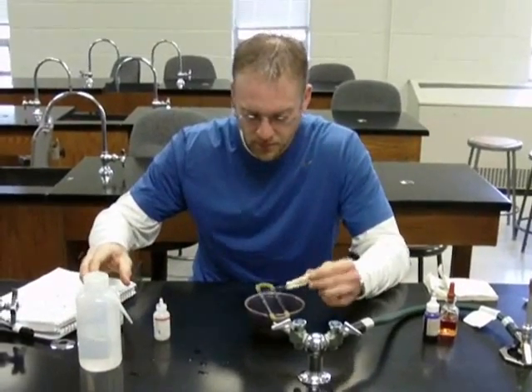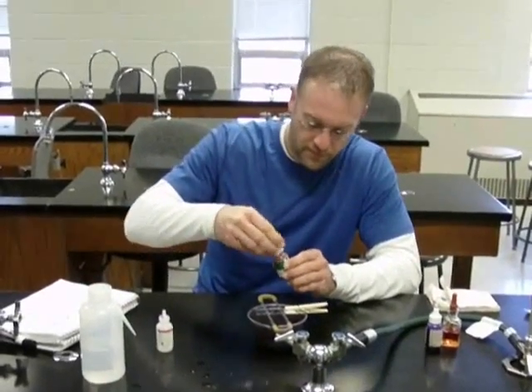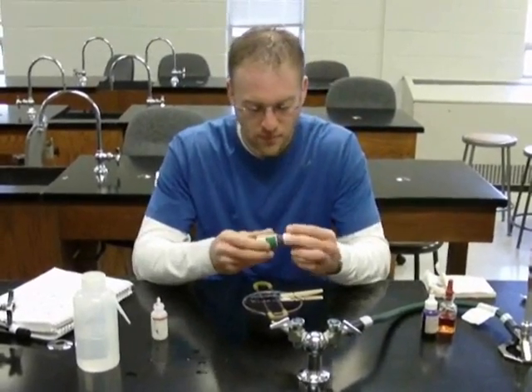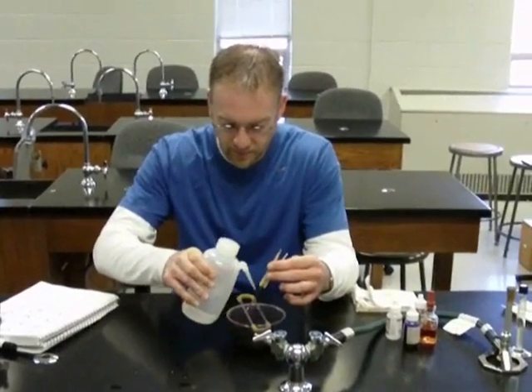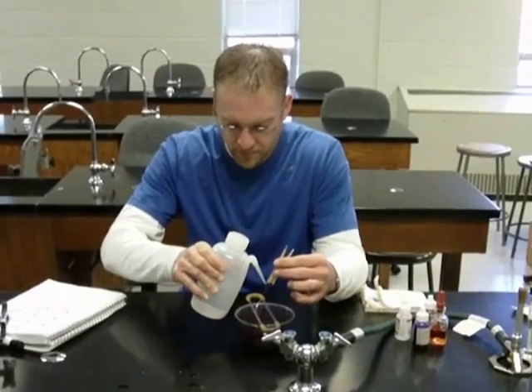Now we're going to add the counter stain of Safranin to stain any Gram-negative bacteria on the slide. We're going to let that react for about 60 seconds. It's been 60 seconds. Now Jason is going to rinse with distilled water, and then he's going to blot dry the slide for observation under the microscope.